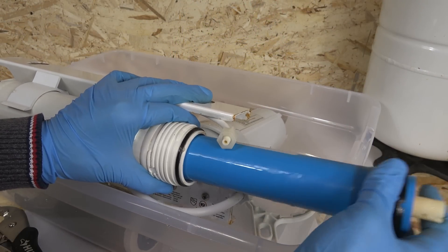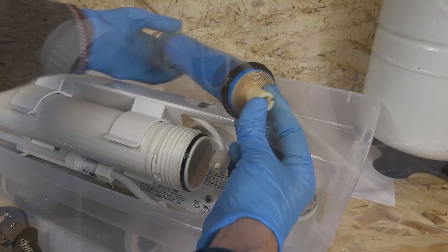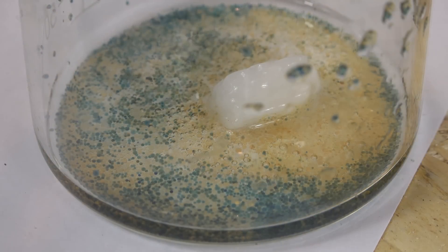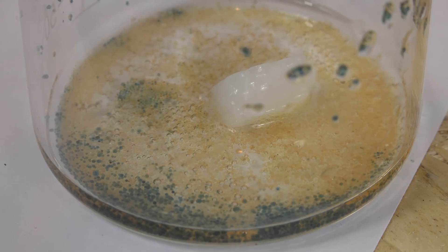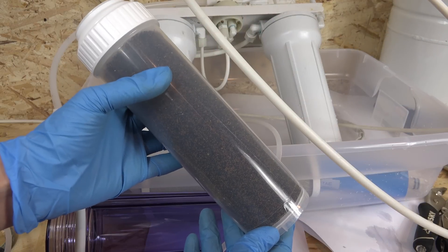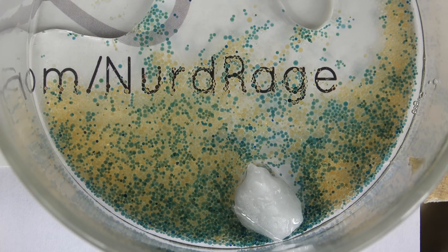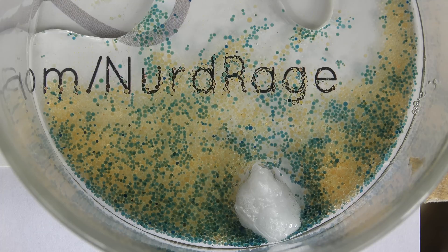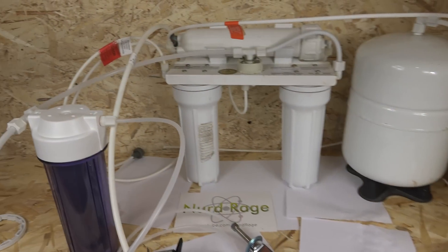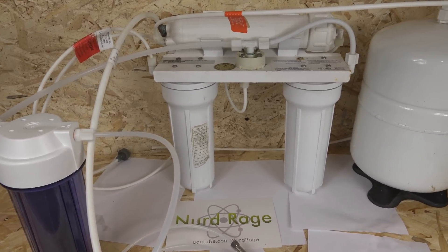The reverse osmosis deionization system uses a reverse osmosis membrane to reduce the level of minerals in the incoming water, and then passes the water through a column of deionization resin to remove any remaining ions. This resin has a limited capacity and will eventually saturate, at which point it will need to be replaced. Most individuals will simply buy new resin and discard the old. But if you use a lot of deionized water and have a very old and inefficient system, buying new resin can become prohibitively expensive.